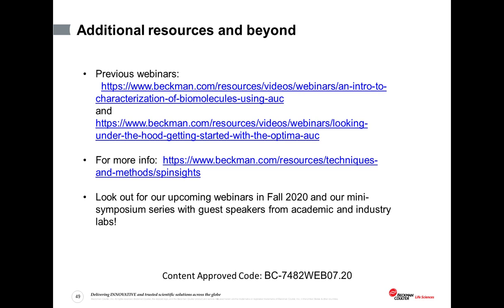And in that context, the effort by Joshi and co-workers in this fed batch schematic design is really great, because they got this amazing increase of density of the producer cells. They also got an increase in the concentration of viral genomes. And best of all, it turns out from their analysis that the viral particles they are making with the fed batch system are as bioactive as you would make with the conventional low density system. And they also have the same packing fraction, more or less. So that's really great, right?